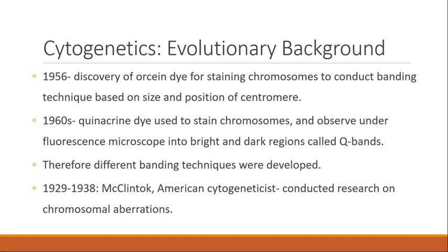So there were different banding techniques emerging, and new dyes were coming up, because dyes play a very crucial role in staining one particular region of the chromosome and observing it under the microscope.